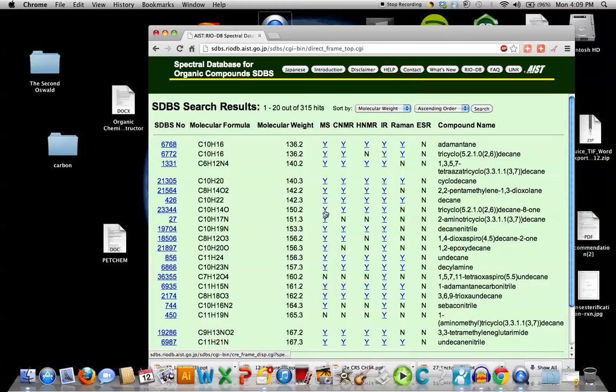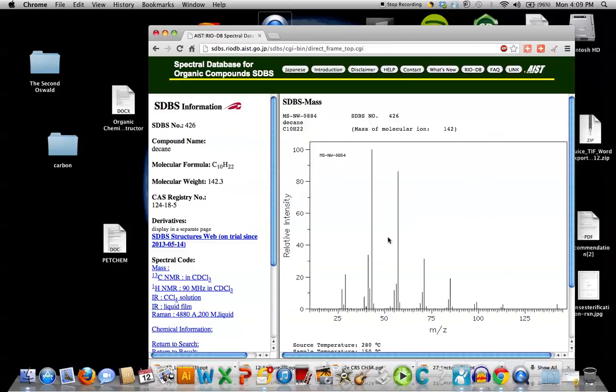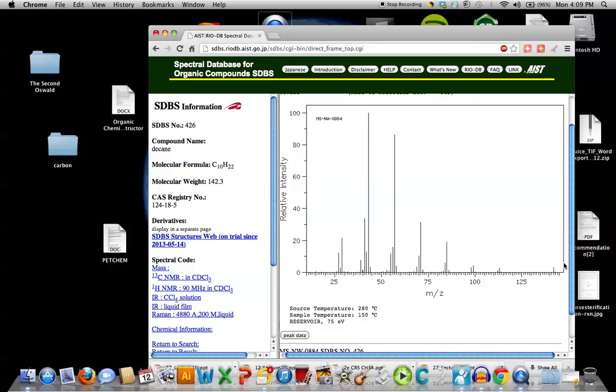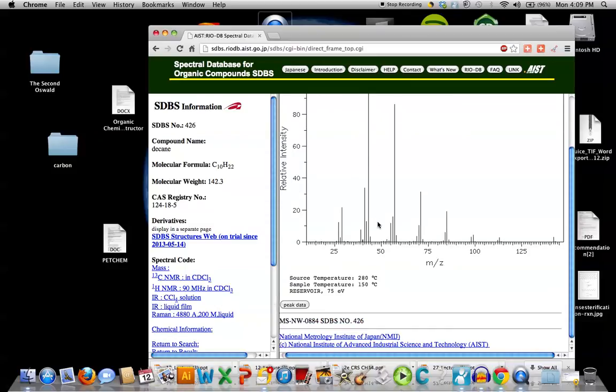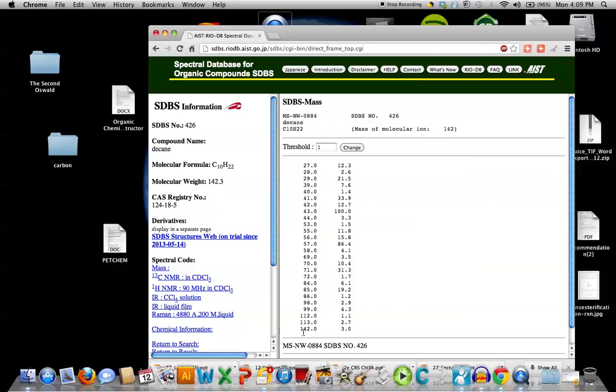There it is. Catalog number 426, C10H22. That's the saturated hydrocarbon and paraffin and alkane. 142.3 grams per mole. Let's look at the mass spec. Catalog number 426. And molecular ion showing up. That'll be further down here. And they're showing you the base peak and other peaks that are showing up as well. Here's the peak data. If you click on this. And your base peak is 43. Your molecular ion is 142. The largest peak furthest to the right in a bar graph.